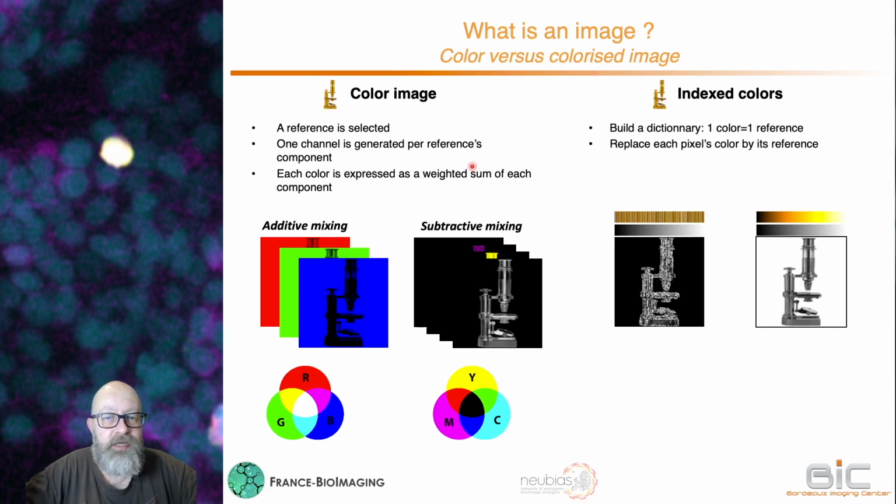A color image is basically made of 3 layers, one red, one green, one blue. But each layer is a black and white image, plus you've got this color coding, so with the shades of red, shades of green, shades of blue. But the 3 information are separated.